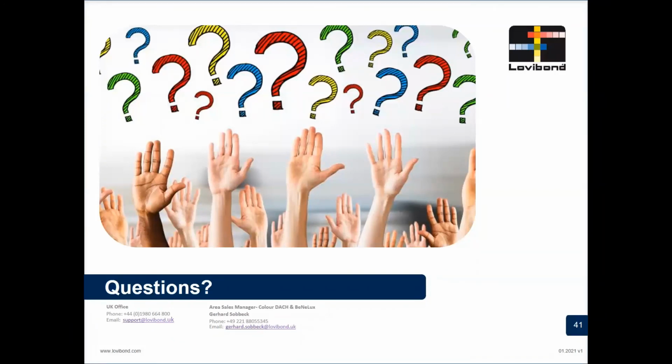Okay, thank you, Peter. Our next question. Does it matter what size opening filter is used to filter samples?